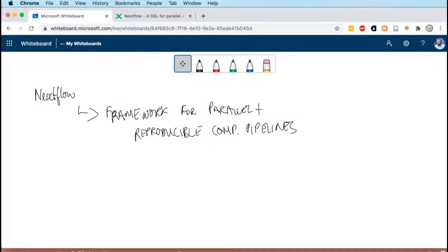A lot of the questions that people ask when you first come to a workflow management system revolve around, well, is this any better than writing bash scripts, basically? I've developed these skills. I'm perfectly competent at writing a bash script with for loops in, for instance, for running the same process multiple times. Why do I need a workflow management system when I've devoted a lot of time to learning bash? And the answer really revolves around this word, okay, parallel.